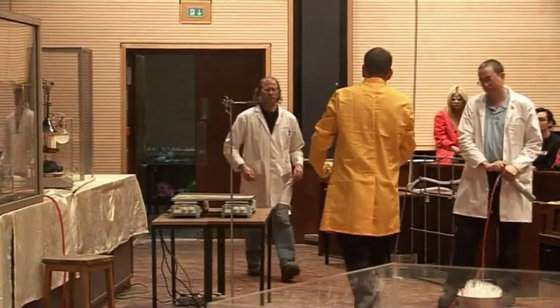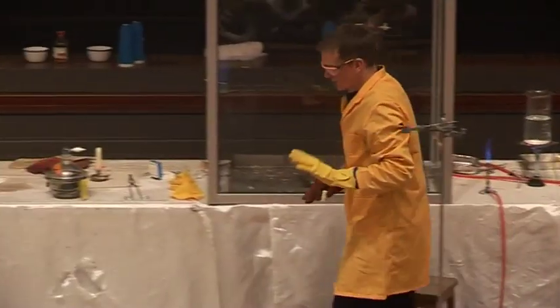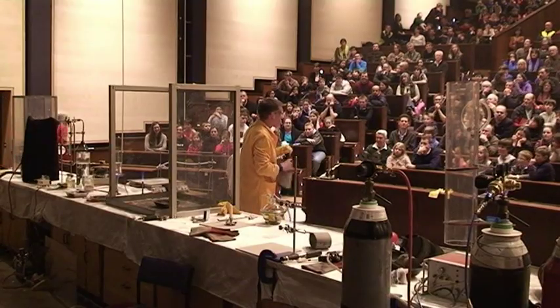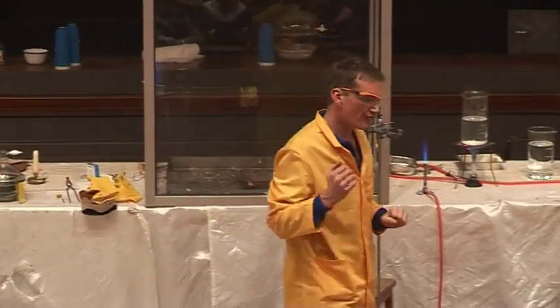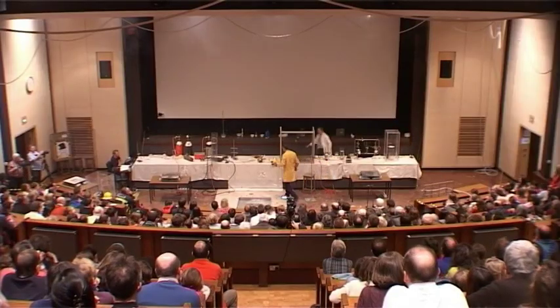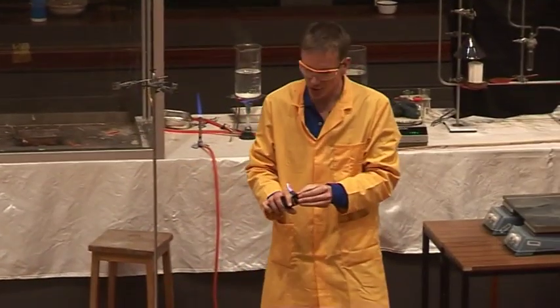Okay, so there we are. The red colour that you saw there was from the lithium that was present. And so the substance reacts with any moisture in the air to form methane. Methane is another hydrocarbon, contains 1 atom of carbon, 4 atoms of hydrogen, and it is flammable. Methane is the gas that we'd normally use most of the time for our cooking. It's the gas that's present in normal natural gas.